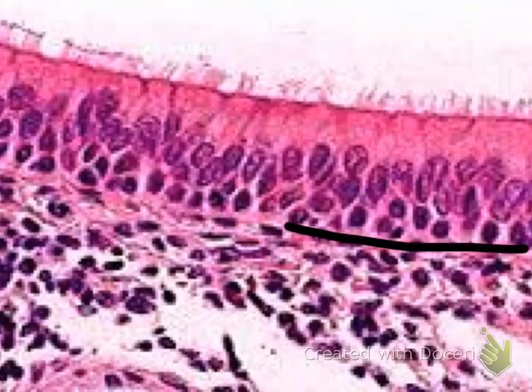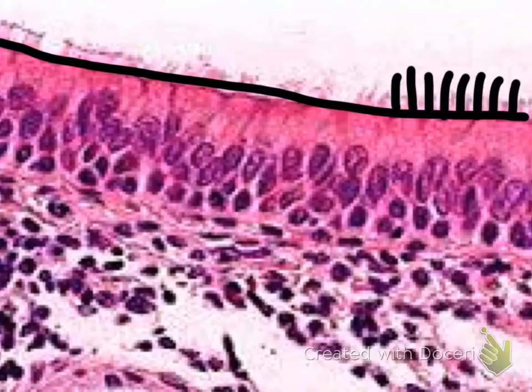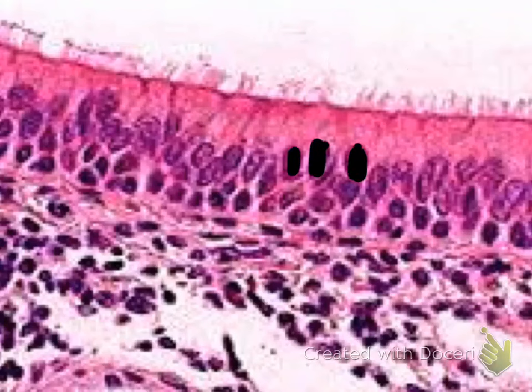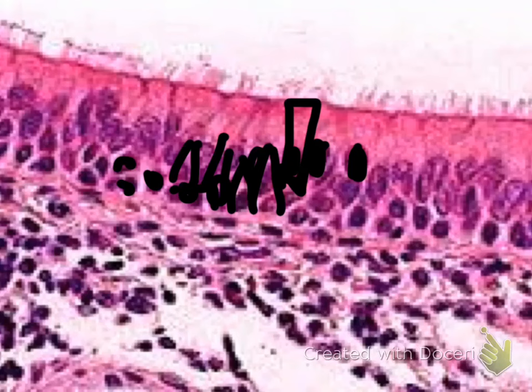Basement membrane. Apical surface. Notice there is something special about the apical surface — you see these hair-like structures on the surface. Those are your cilia. Notice that the nuclei are tall and oval-shaped, and the cells are tall. But it gives you the appearance that there are multiple layers. In technicality, there is still just one layer. So this is your pseudostratified ciliated columnar epithelium.